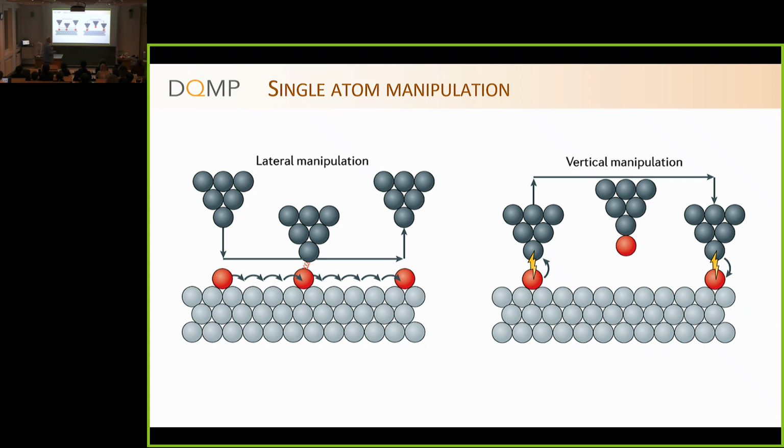This has a very interesting possibility in this configuration, because you see between here and here, or here, you have a different tip termination. So you can start to engineer. That's like changing lenses on a microscope. You can add a filter, but it's a single atom.